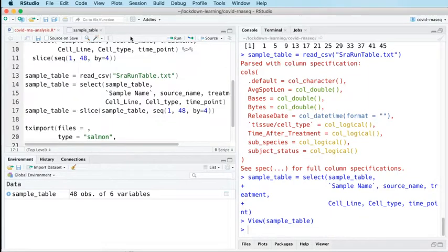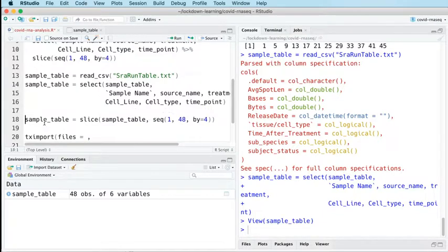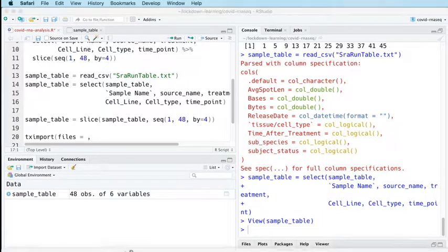Somebody asked a question in the live comments about whether you could use something to do with duplication, the fact that these rows are duplicated, whether you could exploit that in selecting out just a single representative of each set of duplicates. I'm still not really sure how it might be possible to do that.